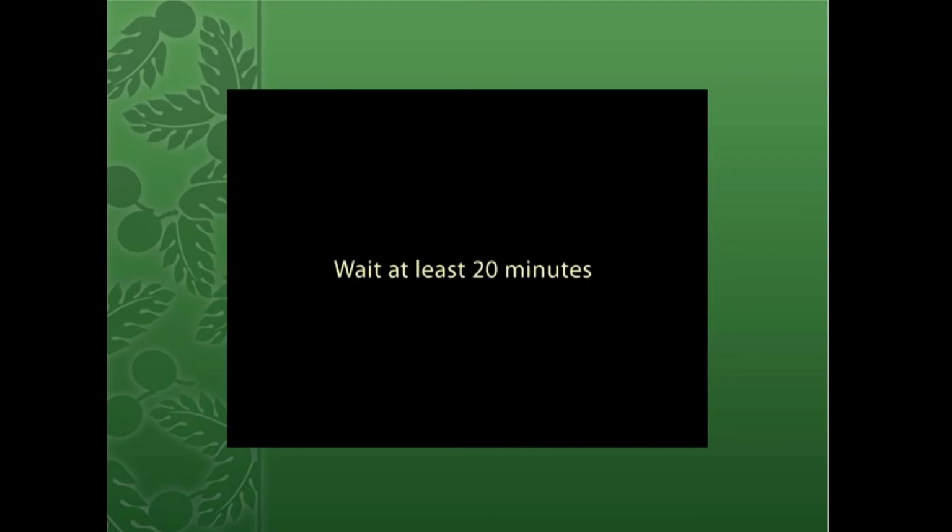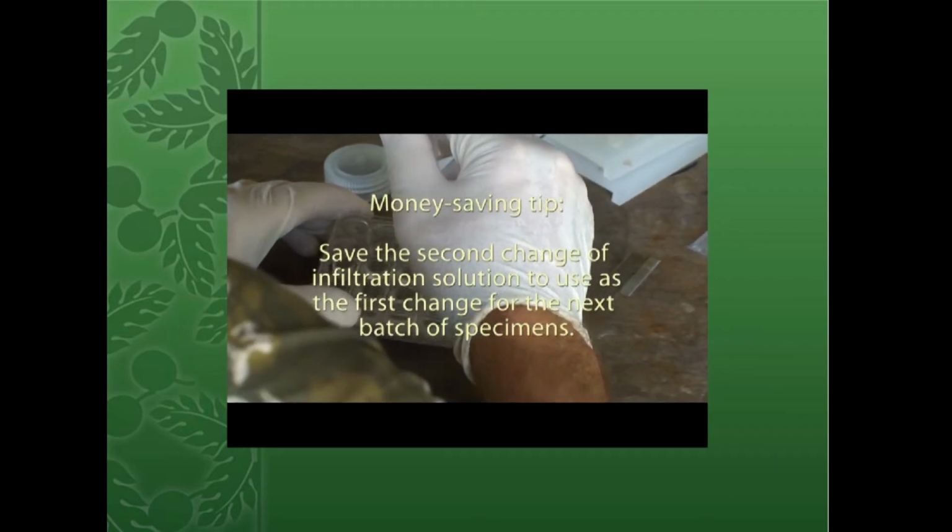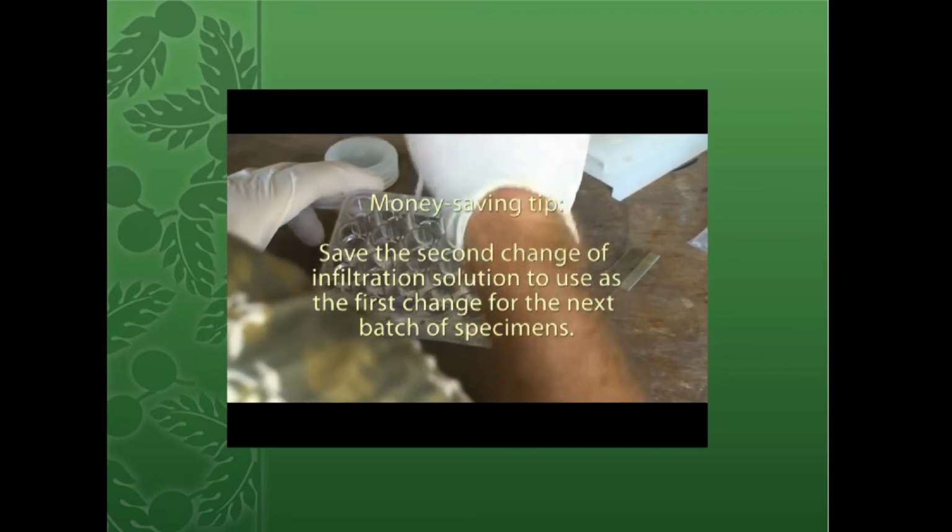Now go back to your subsamples and add more infiltration solution. And you'll wait another 20 minutes. And then remove that infiltration solution.